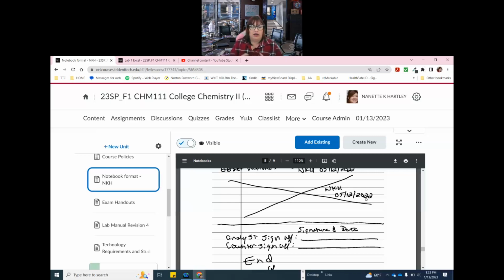Okay. And I will say again, if you don't write it down as you do it, chances are you're not going to remember exactly what it was. And so then you're either going to have to take the measurement again, or you're going to guess as to what that number was. And that's a bad idea. All right.